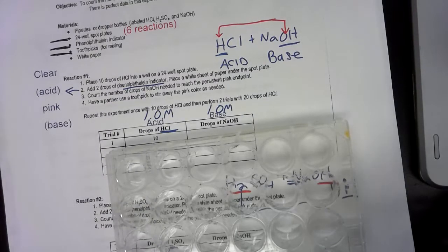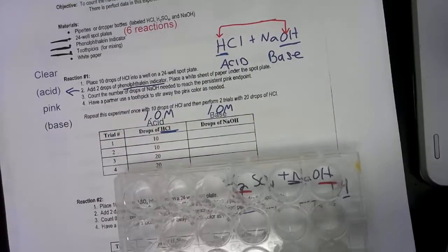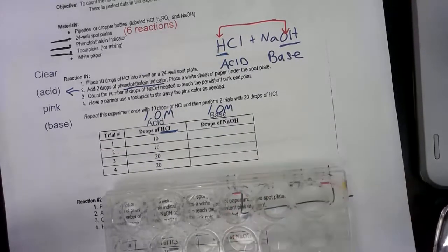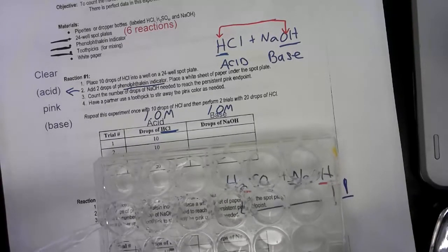Okay. And then we're going to do the other experiment, and we're going to try and do 20. I'm hoping I can get both done here. So I'm going to do 20 just because I'm going to run this next reaction with 20 drops. So I'm going to put 1, 2, 3, 4, 5, 6, 7, 8, 9, 10. And I'm going to do another pipette full and do another. So I'm doing 20 here. So that was 10, 11, 12, 13, 14, 15, 16, 17, 18, 19, 20.